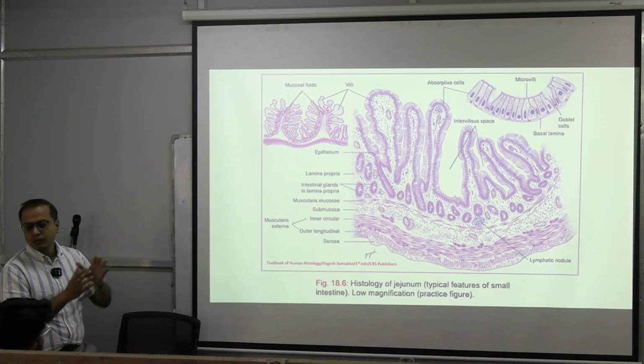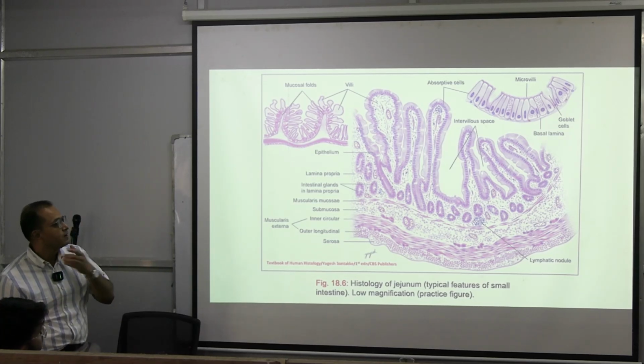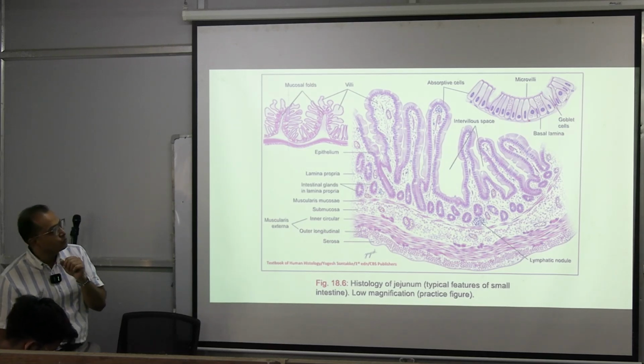Now, next we are left with one specimen, which we call the ileum specimen. The ileum specimen should look like this, having all 4 layers present in it. The only difference is what the ileum has, which we have to remember. I would emphasize remembering the morphology of the ileum. What special thing does the ileum have? It has these mucosal projections, the villi and microvilli.